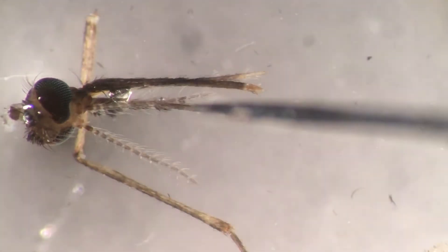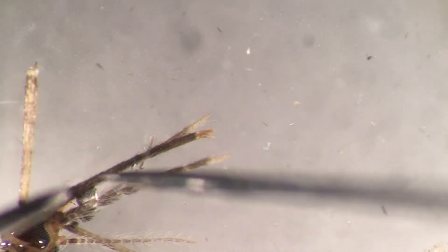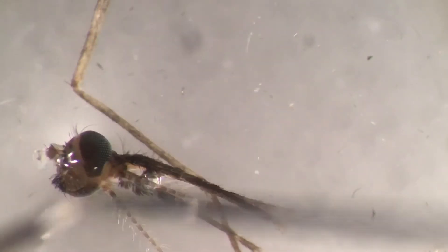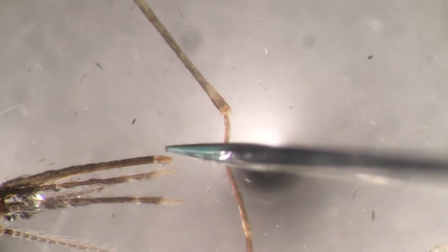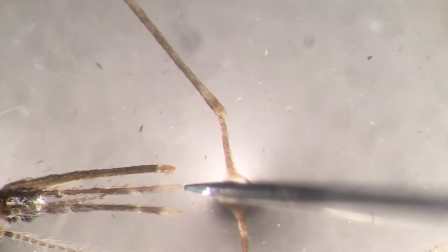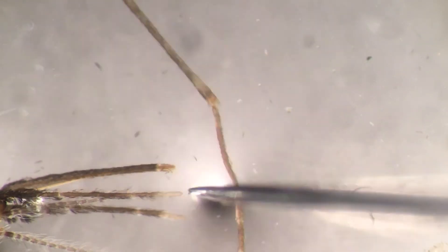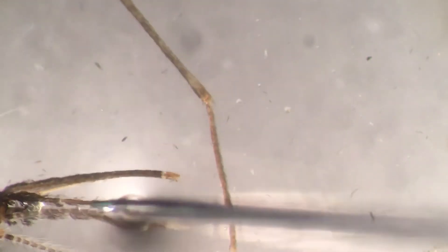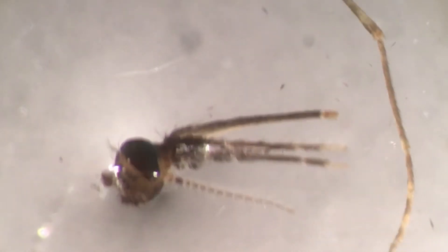The male antennae are covered with hairs because they have the function of detecting pheromones and other female molecules for mating, so they're huge. But in females they're small. The proboscis is the actual piercing structure - it's between the two palps. There it is: that's one palp, that's the proboscis, and that's another palp. The actual piercing bit is inside, as this is like a sheath, and inside is the actual piercing structure that goes inside the skin.